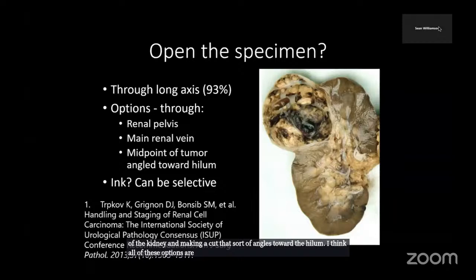Basically, the goal should be to highlight the interface of the kidney tumor to the renal sinus, which is the most relevant area for staging.